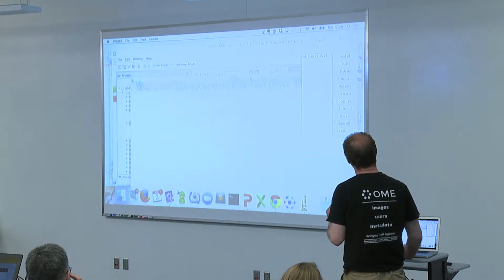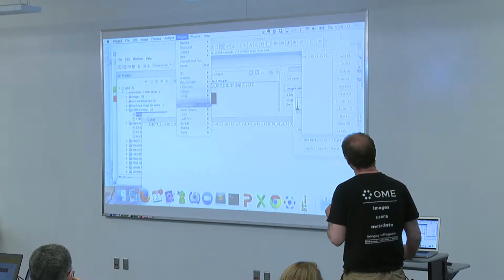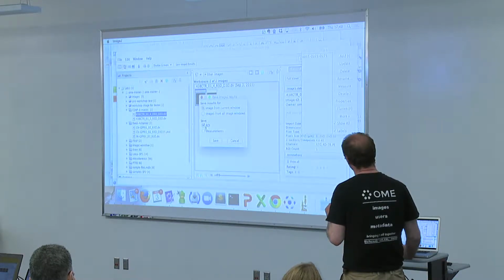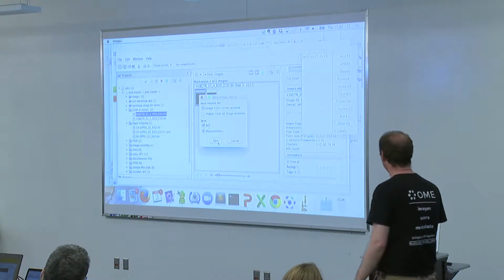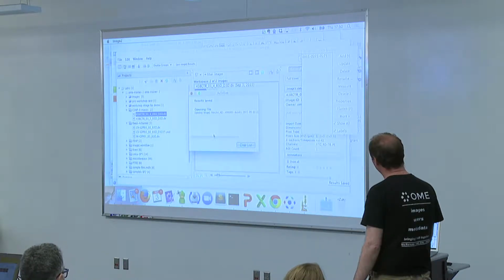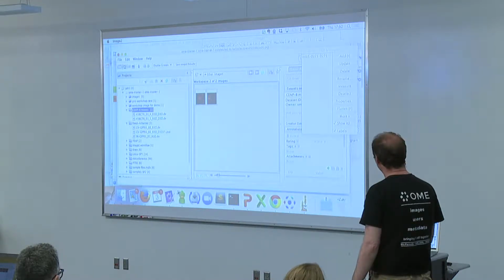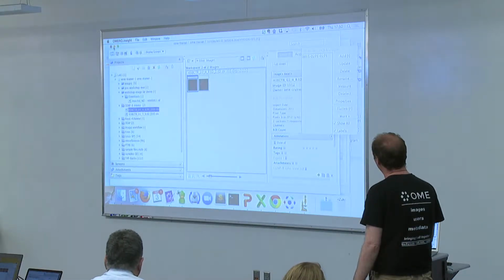And then in ImageJ, go plugins, OMERO, save ROIs to OMERO. It enables me to click also on the measurements so that I don't have to bother twice. And of course I can save all the open windows with all the regions of interest and measurements to the appropriate images. And I go save. You saw that it didn't re-import the file, it just says results saved, which is to be read as the results and the ROI were saved.